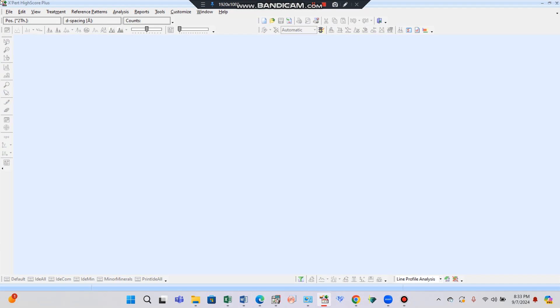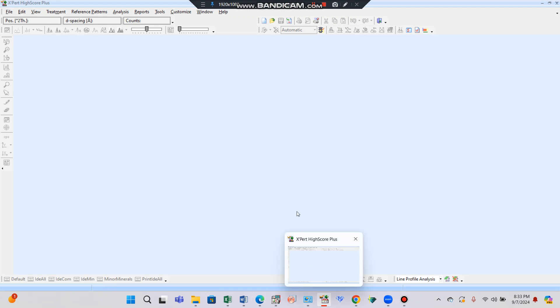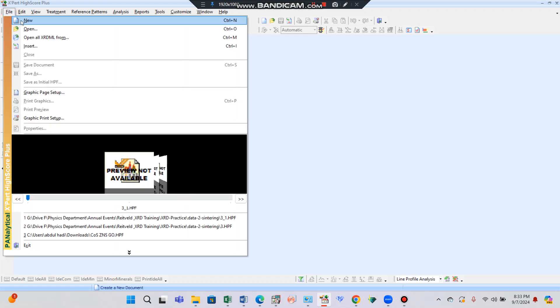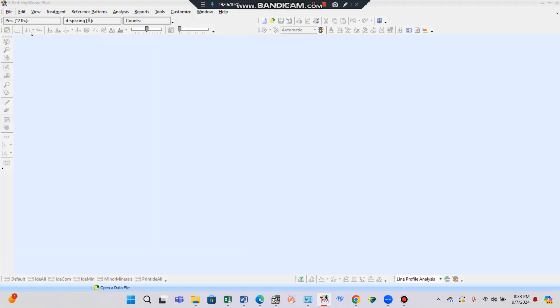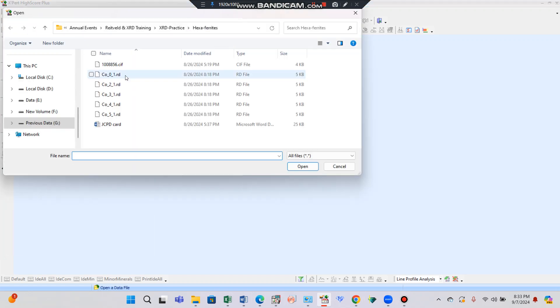First of all, open the HighScore Plus software, then click File and open the file which has the extension .rd — 'r' stands for raw, 'd' for data — raw data files obtained from the X-ray diffractometer.